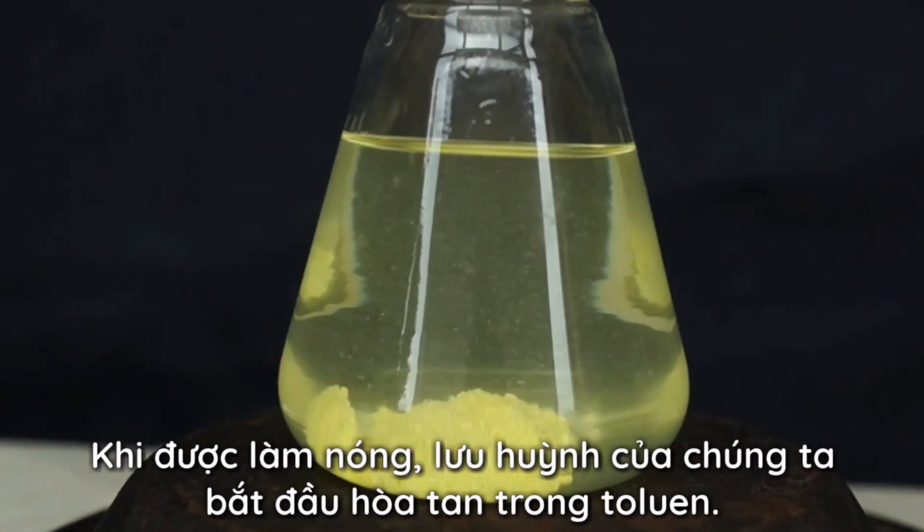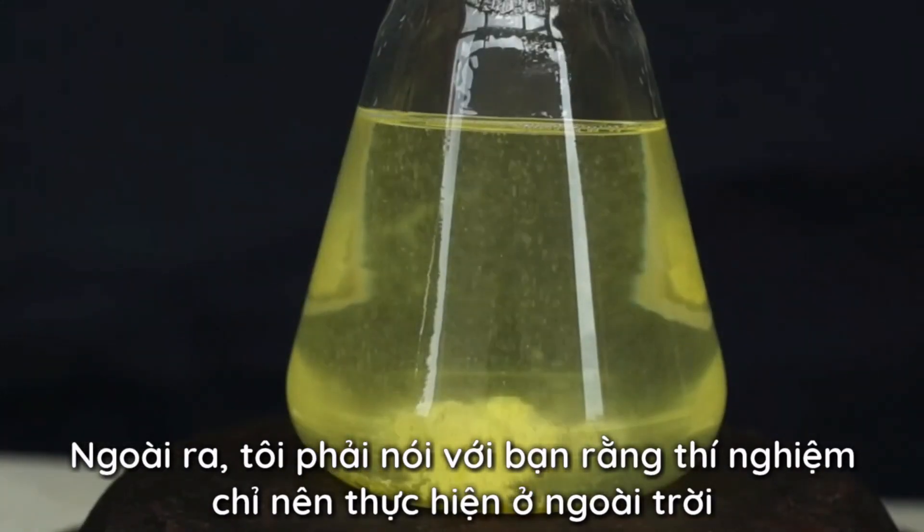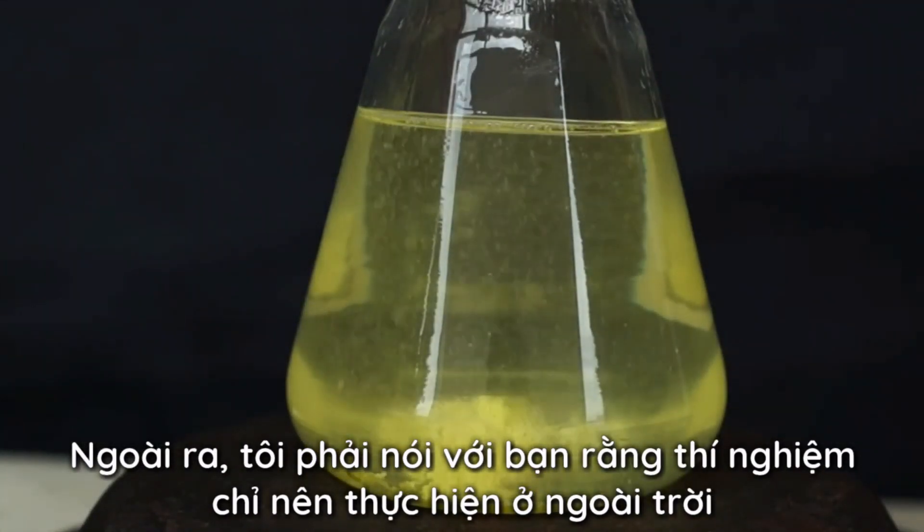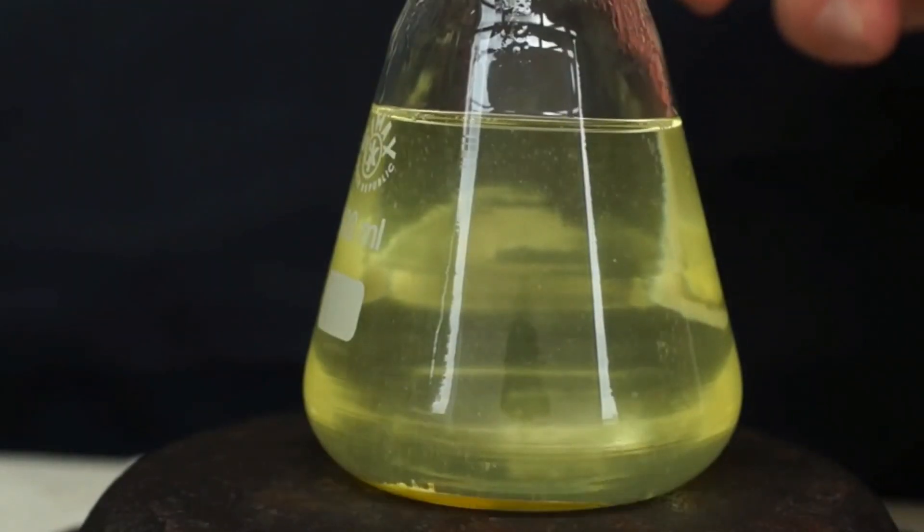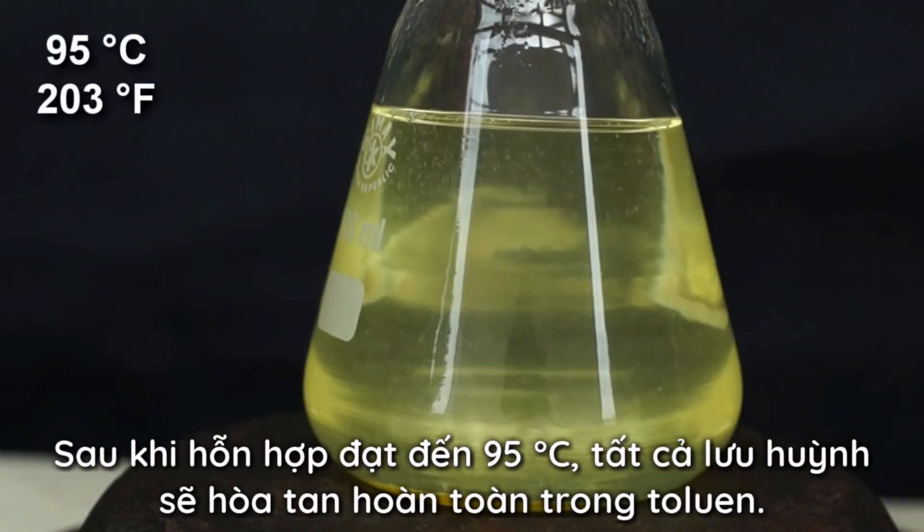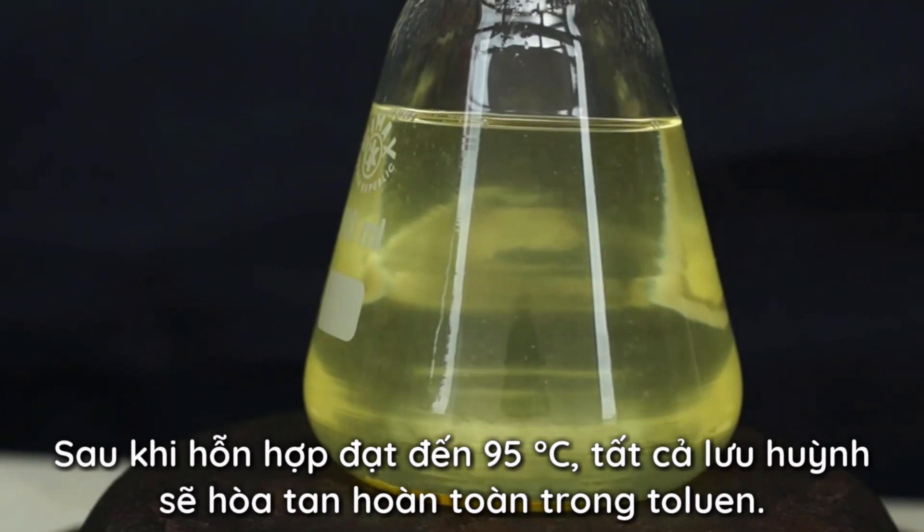When it's heated, our sulfur starts to dissolve in toluene. Also, I have to tell you that this experiment should only be done outdoors or inside a fume hood. After the mixture reaches 95 degrees Celsius, all the sulfur will completely dissolve in toluene.